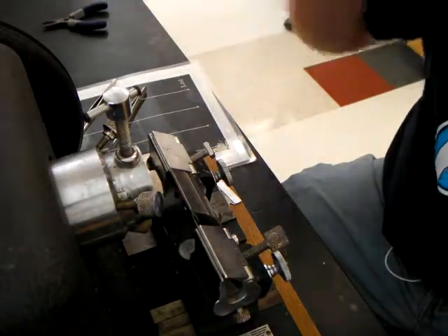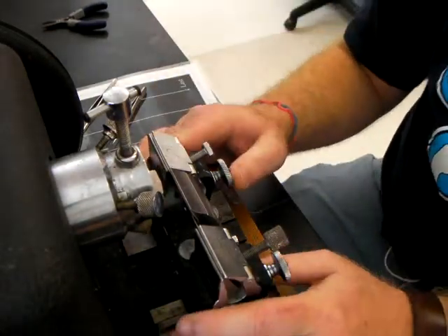Sectioning specimens part 2: preparing the block for sectioning.